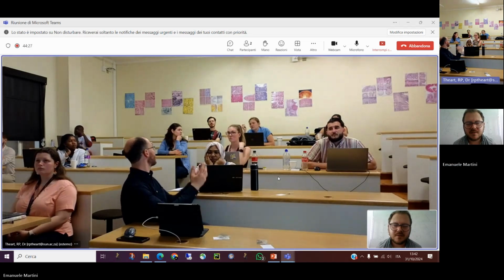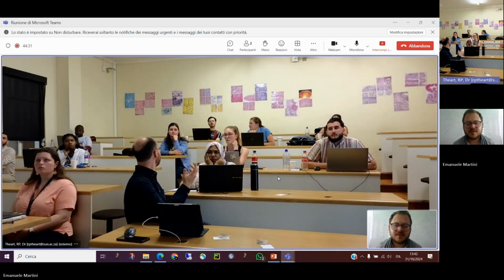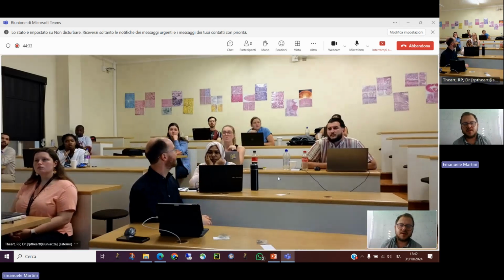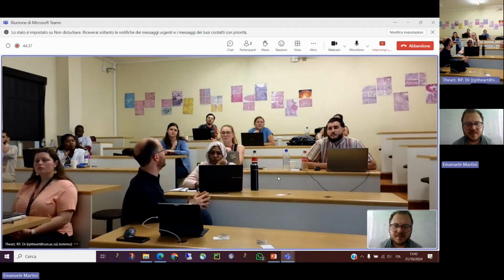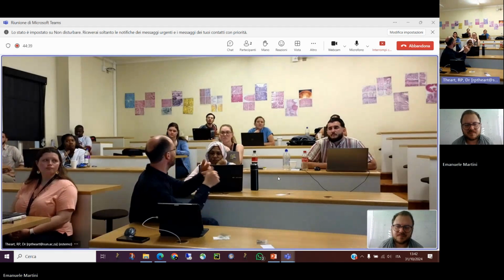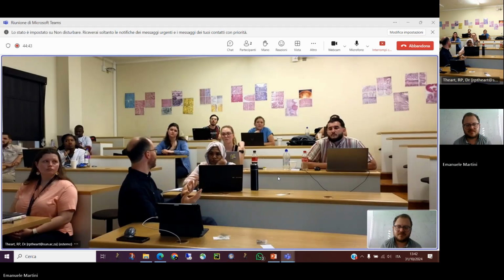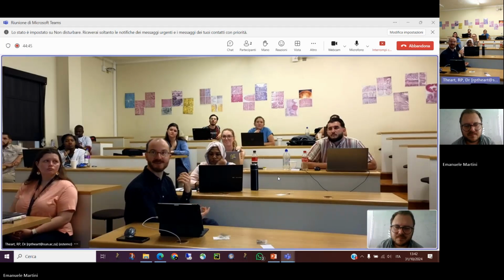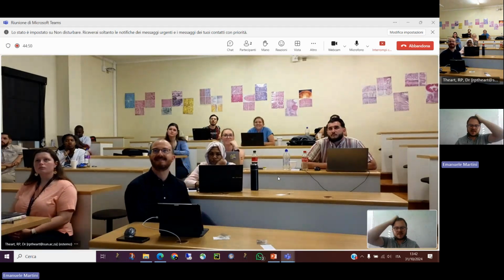Yes. So you can extract those parameters with the measure function that I showed you. So what parameter might be useful? How will you approach it? If you have some ideas, if not, it's okay. Remember that we had area, perimeter, form factor, aspect ratio, all of those are parameters. So what would be helpful? Yeah, so we've got an answer here. Area would be helpful. Yeah, you can try to extract the area, no?